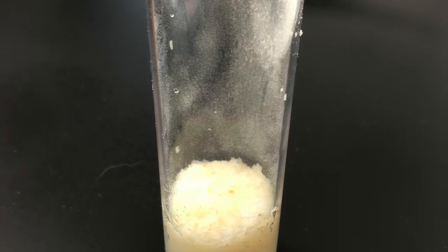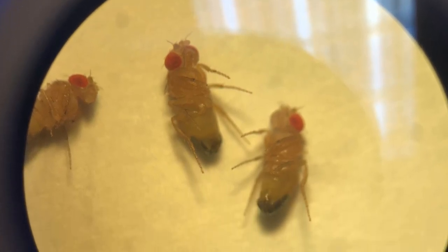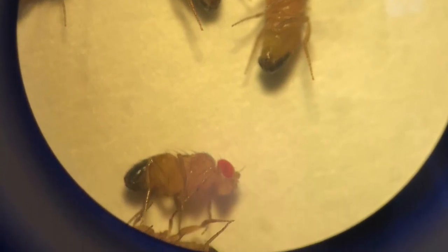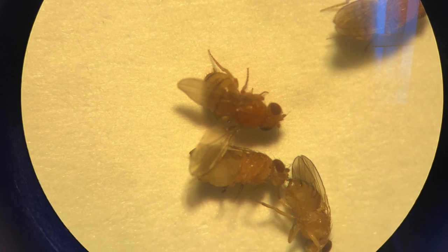Next, 10 flies were given. For this experiment, 5 male flies and 5 females were given. The male flies were red-eyed and wingless, and the female flies were sepia with wings.